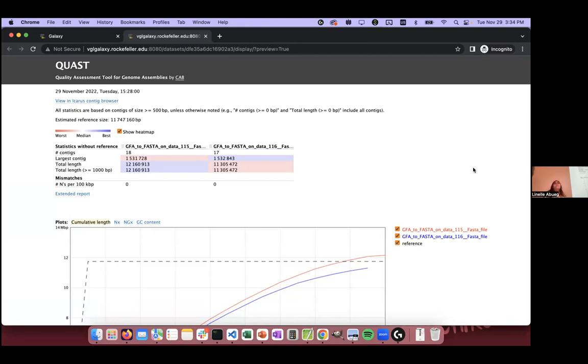So there is something that is broken, and we broke it on purpose, because otherwise this technology would resolve all the chromosomes in one piece with such a small genome. But to give you an idea that we're missing a link here, and that's what the scaffolding will allow us to recover. So we're going to work with hap1, or whichever one happens to be your 18 contig one.